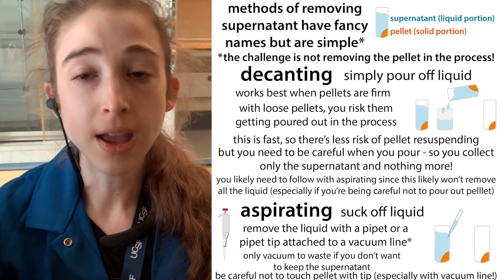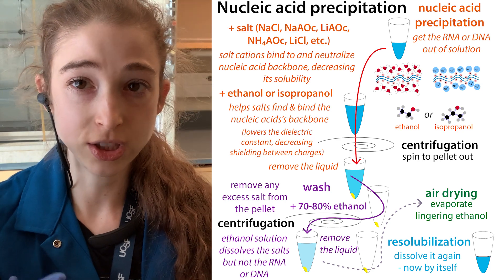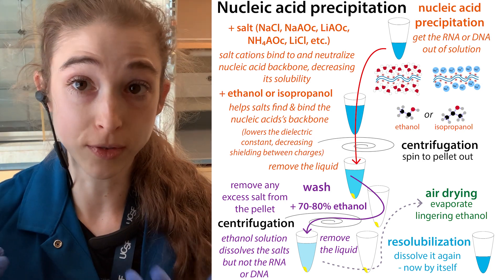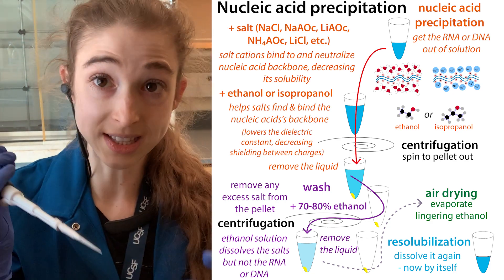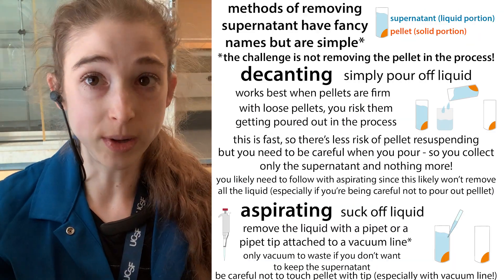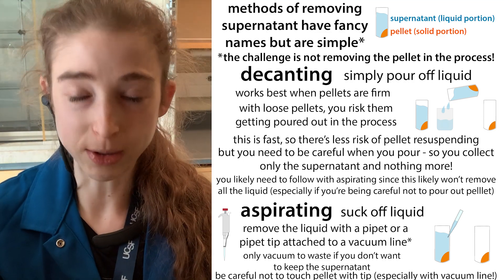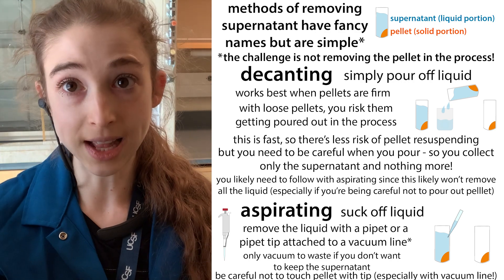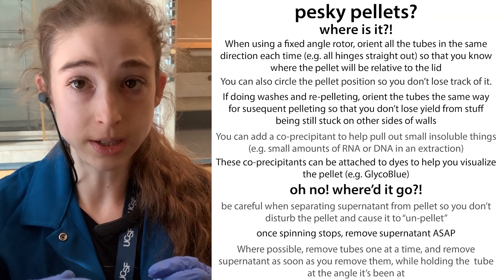Getting that last bit of liquid is really important when doing RNA and DNA extractions, where residual isopropanol or ethanol can mess up a further step. After pouring off, there will be some remaining liquid that you can then aspirate out.